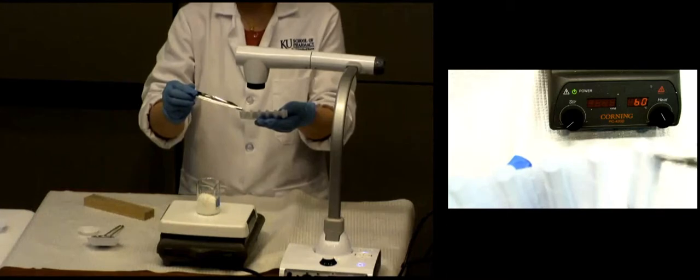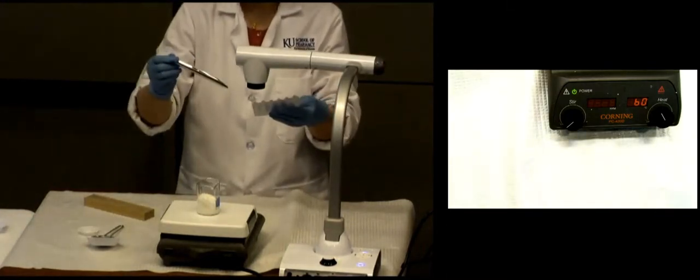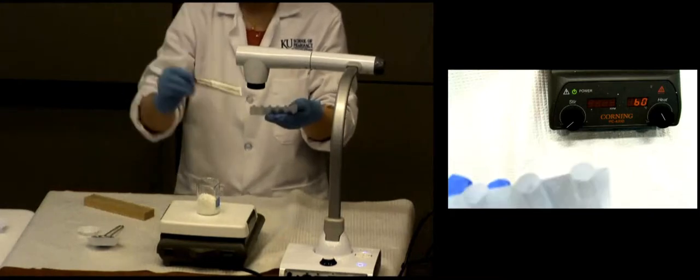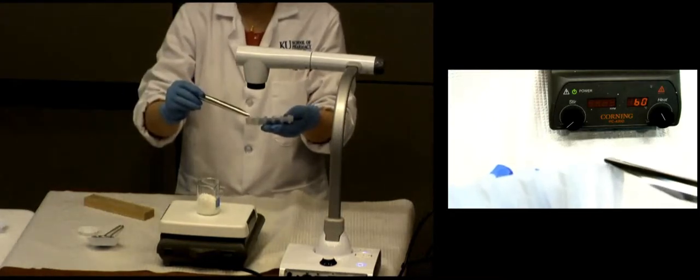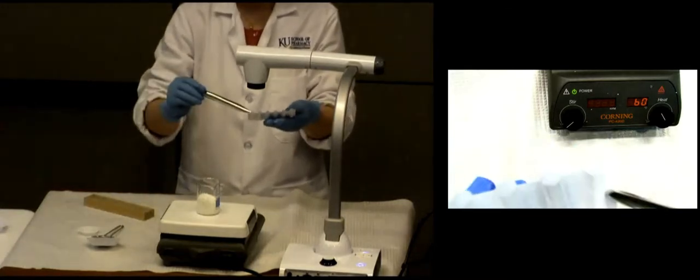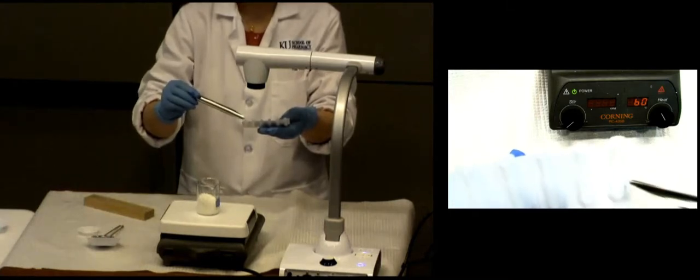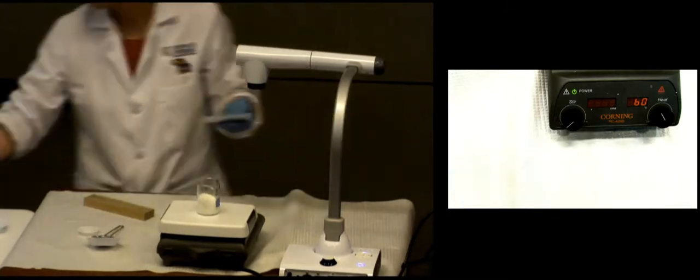Okay, as the liquid congeals, it's going to actually shrink a little bit and typically cause a little bit of a hole in the middle. Therefore, you want to overfill to the very top. In the end, when it actually becomes solidified, you can cut the top off. Therefore, the bottom one is the actual product you can dispense. Okay, all right, so that's about the plastic shell.